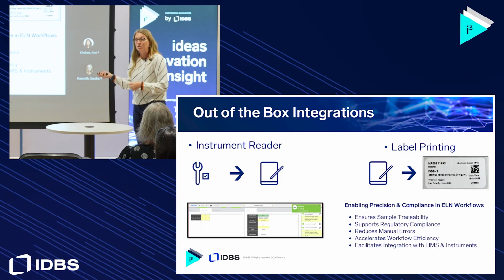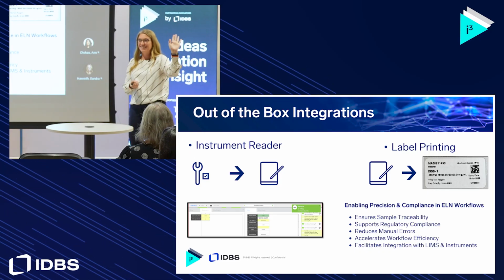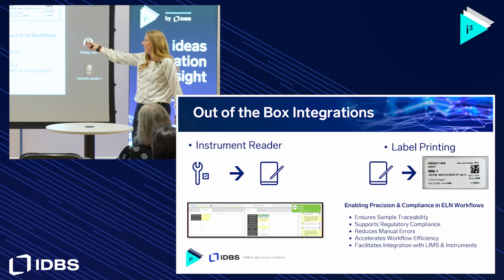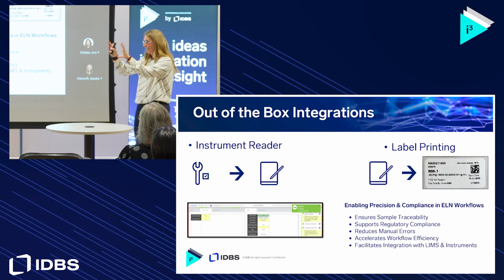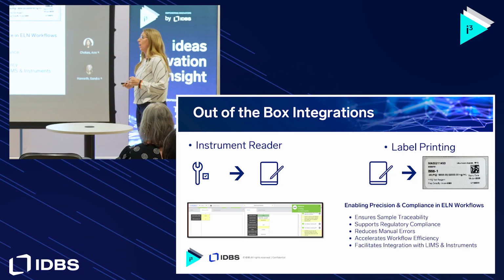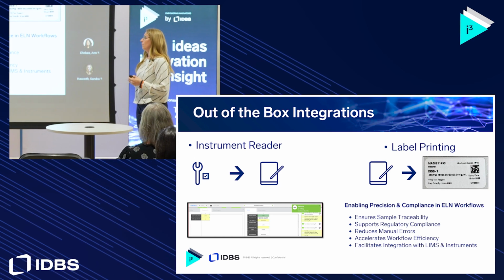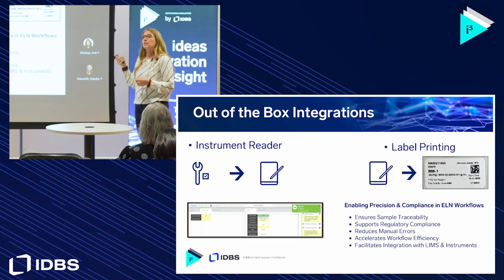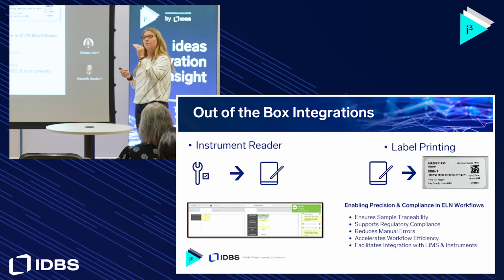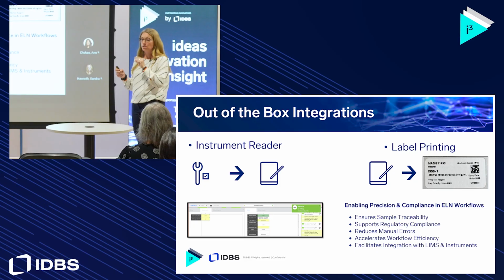So, out-of-the-box integrations. I don't know, is anybody else using instrument reader or label printing? Yes, great, a few people. I love instrument reader. It's kind of funny because it always gives you the toaster pop-up that says, I got your weight. But that's a really nice indicator for the end user as they're weighing out their compounds, weighing out reagents. I don't know if anybody has looked into the audit trail for instrument reader, but when we validated it, it's so neat. It really is very descriptive, and any auditor looking in that audit trail will know exactly that the user didn't type that in.